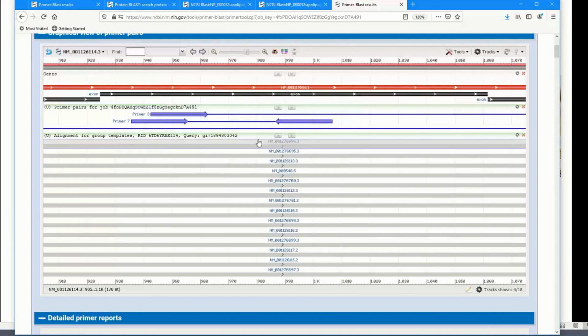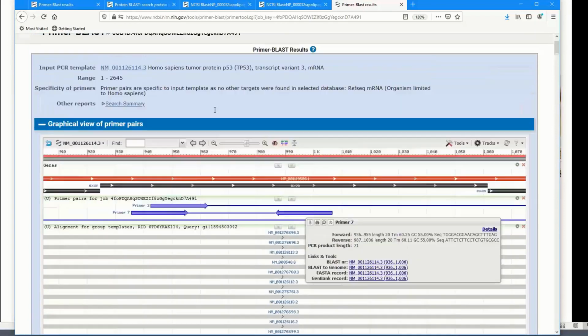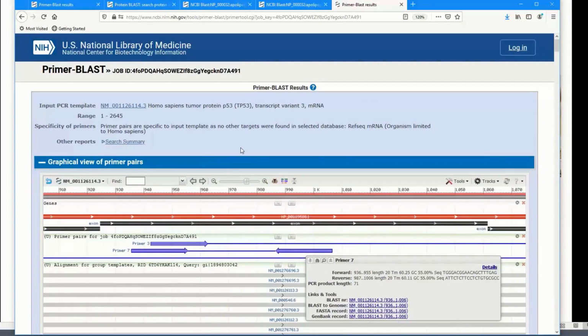genome. So what I've done to make life convenient is I've taken these primers here and copied them so that I have them in that file. And like I said, that file is at the link where Rana posted in the chat if you want to look at it. So what I'm going to do is go to the assembly database first, because what I want to do is to load the assembly that I want to use as a database in Primer Blast.